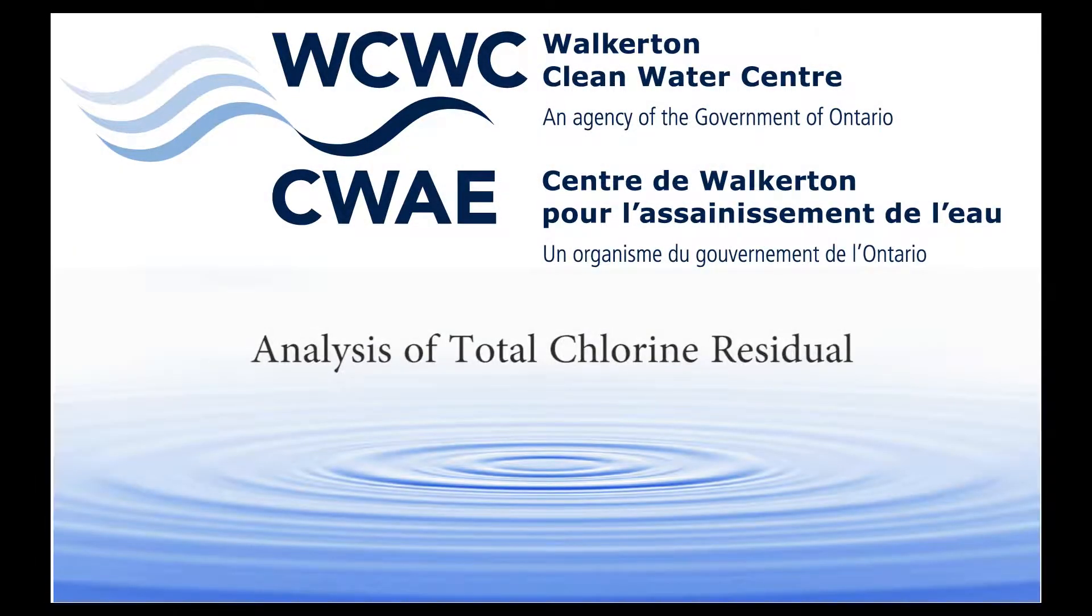This video will demonstrate how to properly analyze the total chlorine residual of a drinking water sample using the DPD method.